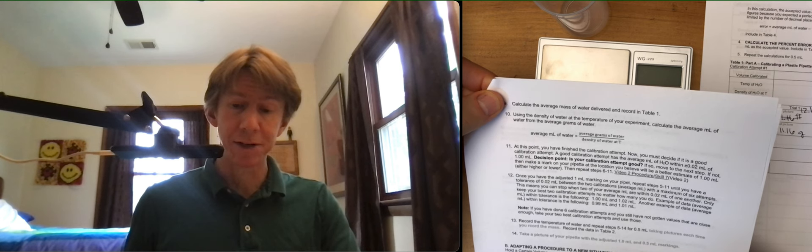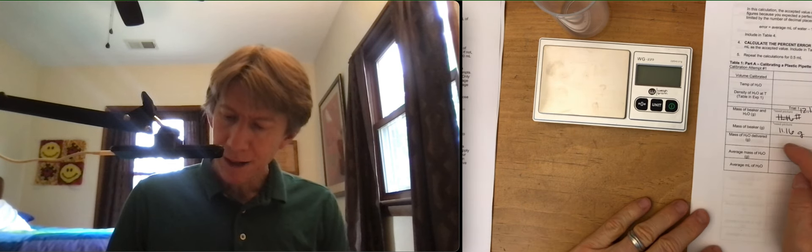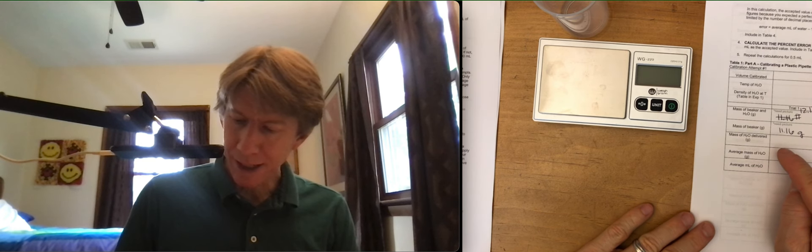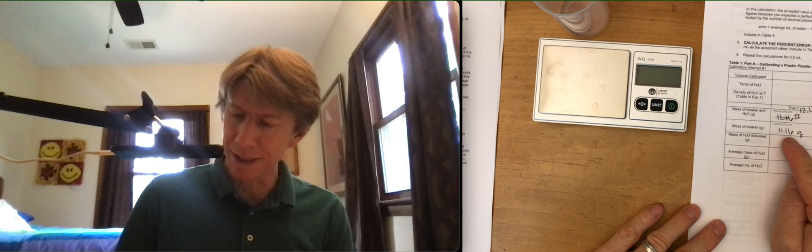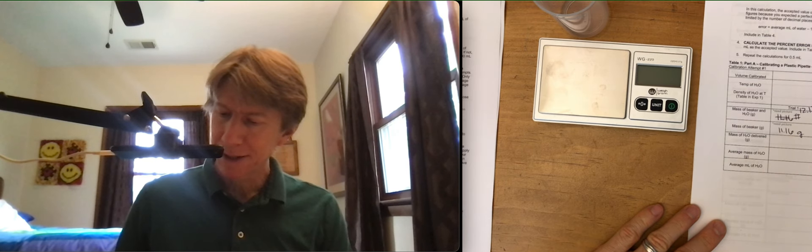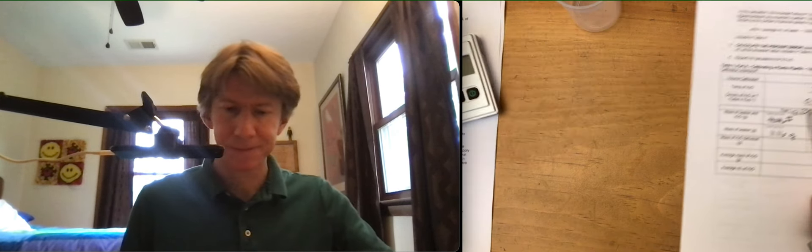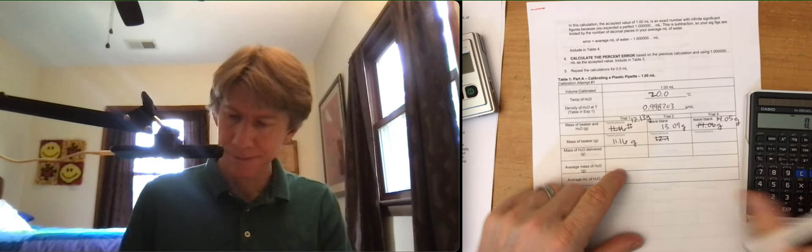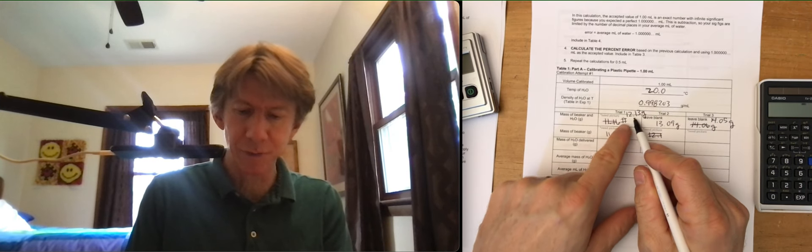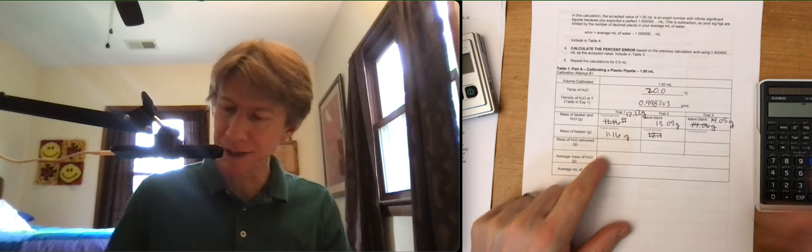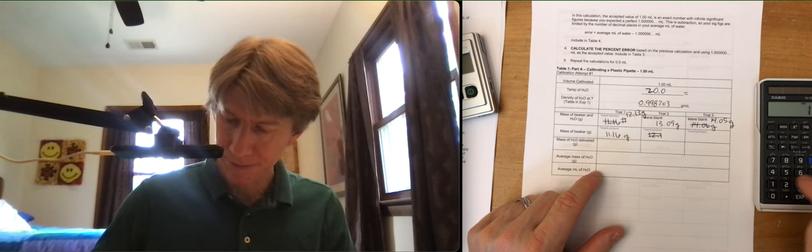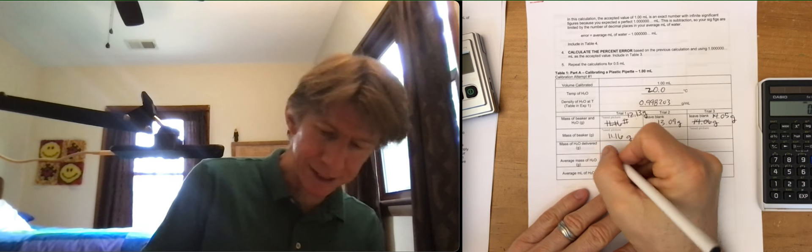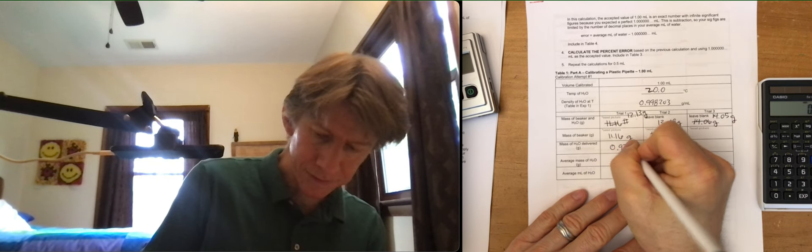Next is calculate the average mass of water delivered and record in table one. Remember, yes. So I'm going to get my three masses. I'm going to take and subtract. Let's see. So it's going to be 11.16, sorry, yes, 12.13 minus 11.16, 0.97 grams.